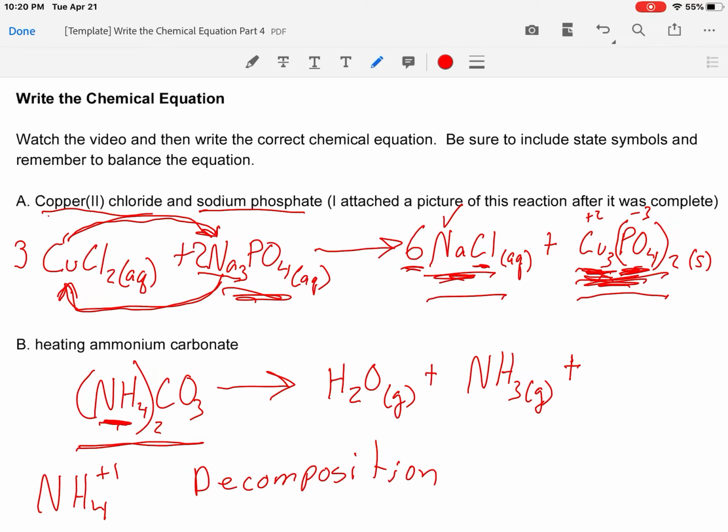Or the burp test from the other day. In the case of the bubbles in the foam from the hydrogen peroxide decomposition, it didn't burn the gas, but it sort of made the wood splint flare up a little bit. That indicated oxygen. The fancy way of saying it is that gas, that oxygen, supports combustion.